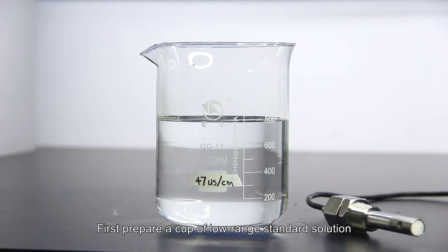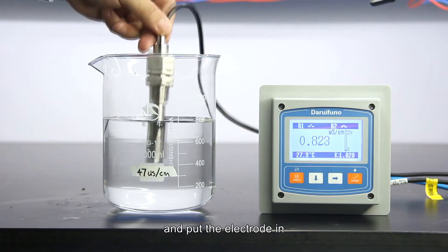First prepare a cup of low range standard solution, such as 47 uS/cm solution, and put the electrode in.